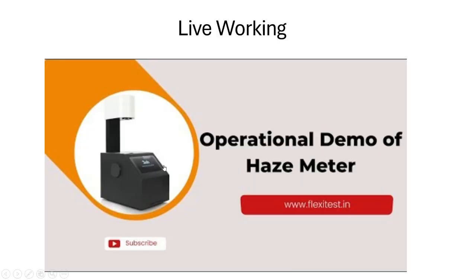Here is the live working of a Haze Meter, which I'll be adding in the group description.